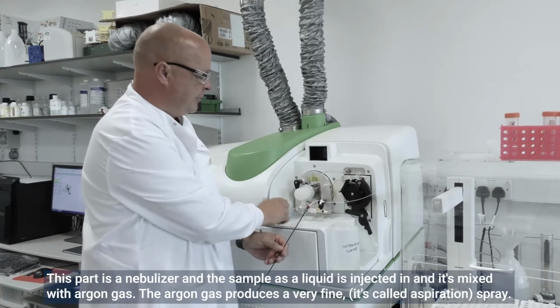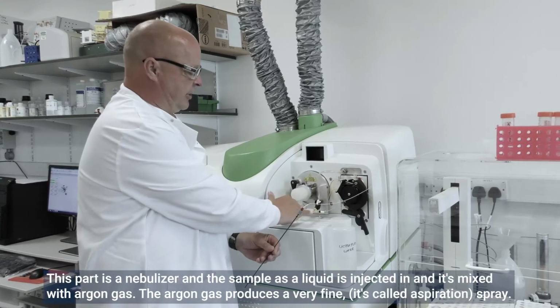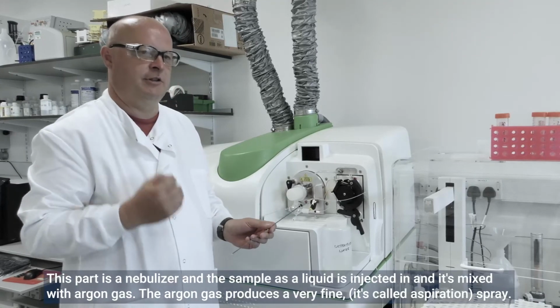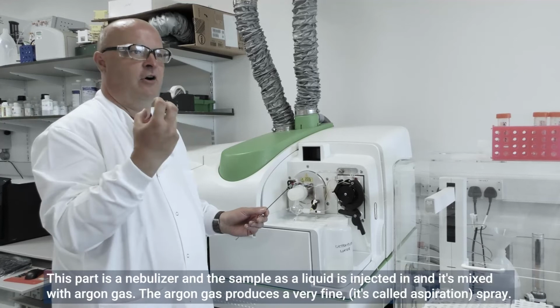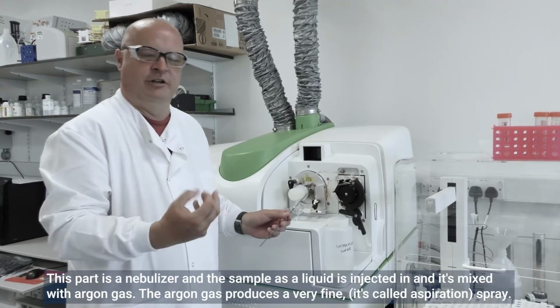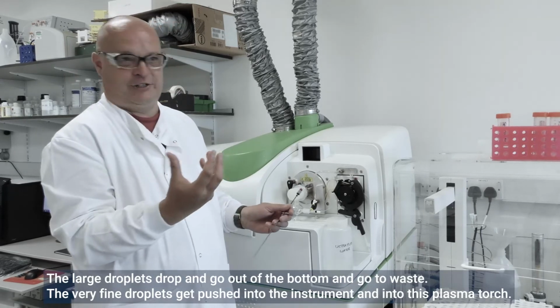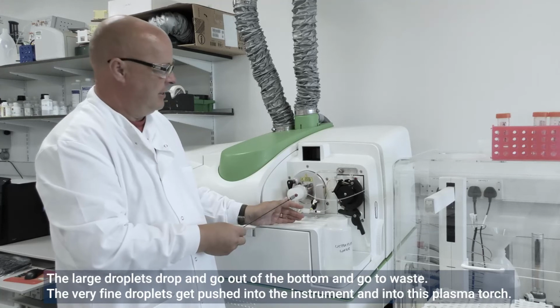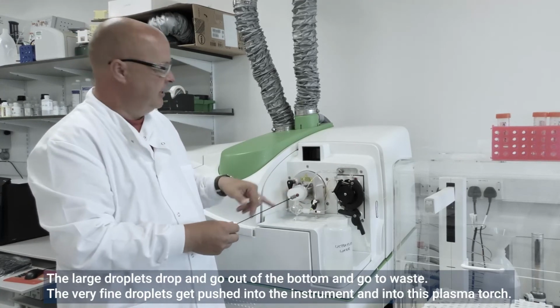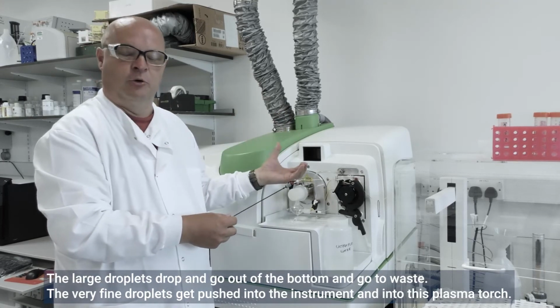This part is a nebulizer, and the sample as a liquid is injected in and mixed with argon gas. The argon gas produces, it's called aspiration, a very fine spray. The large droplets drop and go out the bottom and go to waste. The very fine droplets get pushed into the instrument, into this plasma torch.